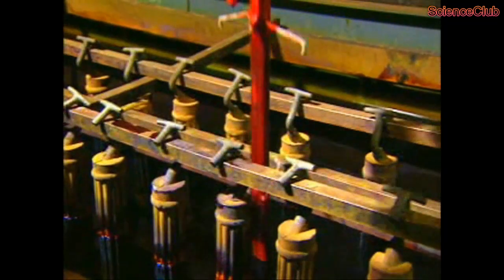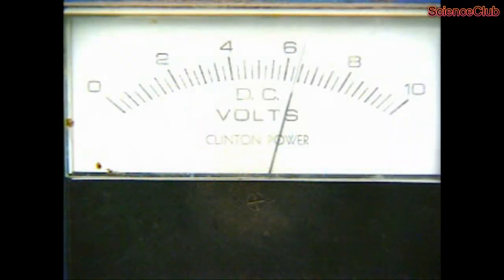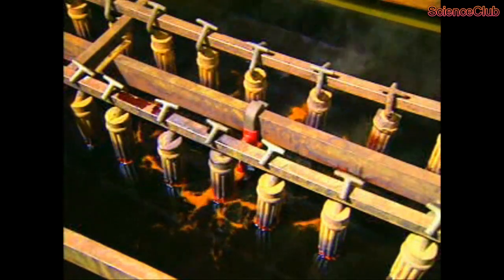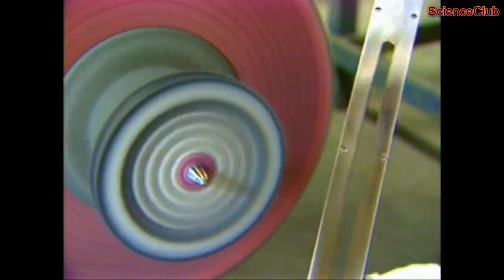In the electrolysis unit, the base metal is used as the cathode, and a lead bar immersed into chromium solution is used as the anode. As direct current flows, chromium metal is deposited onto the base metal. When the desired depth of plating has been reached, only a final rinse and polish is needed.